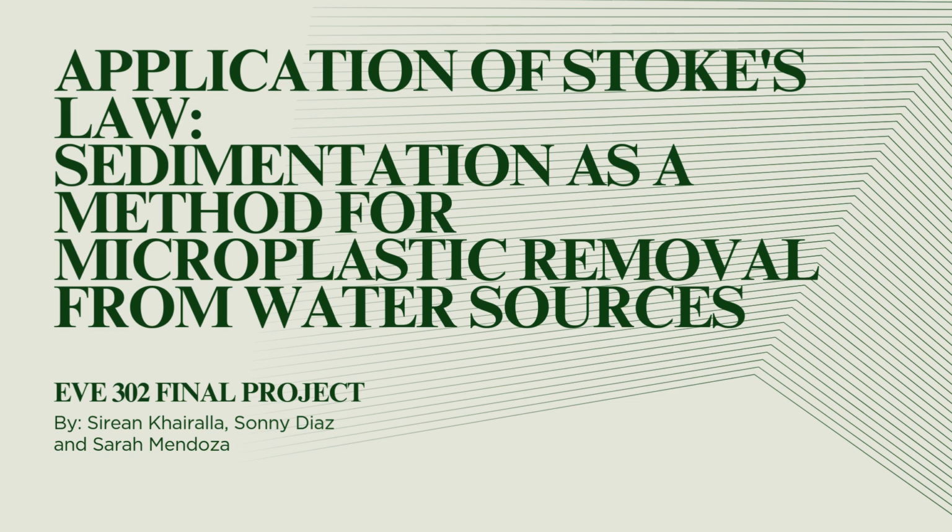I'm Sirean, and together with my teammates Sonny and Sarah, we've been investigating sedimentation processes for removing microplastics from water. Today we'll demonstrate how particle characteristics and coagulants affect sedimentation rates, which is crucial for designing effective water treatment processes. We'll show you our experimental setup, results, and analyze how they align with theoretical predictions based on Stokes' Law.